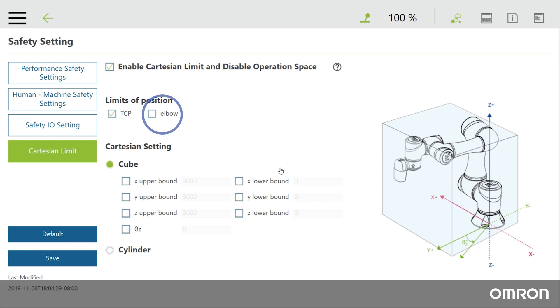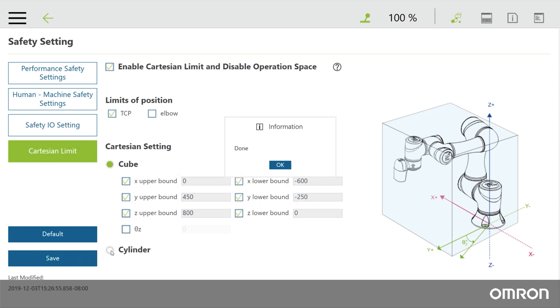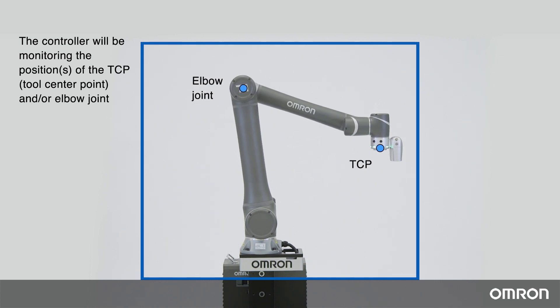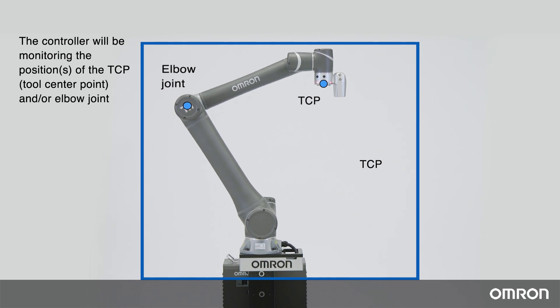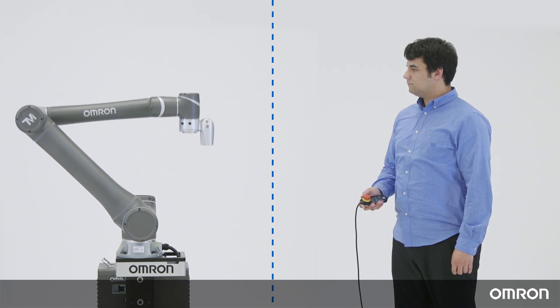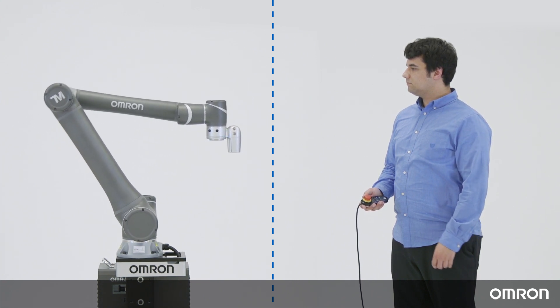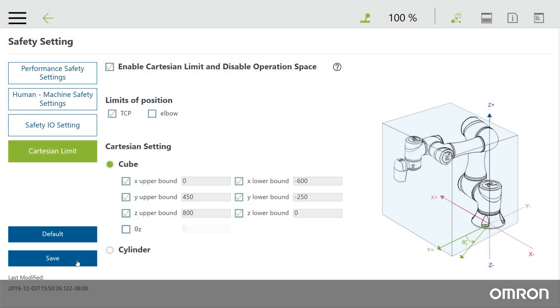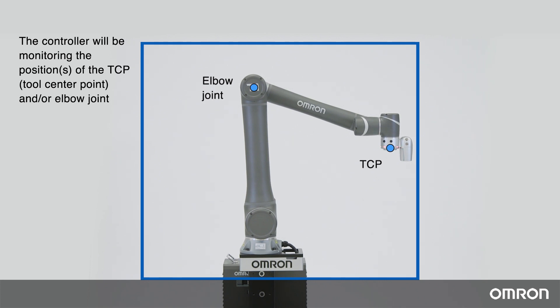Designate which parts of the robot are being limited by the Cartesian space. Users can set the upper and lower bounds on the X, Y, and Z axis to construct a cube around the robot. You can also create a cylinder using upper and lower bounds of the Z axis and the radius of the cylinder. Let's create a cube. See how the robot can't move outside of this cube. Instead of setting up a whole cube, you can designate a plane too. For example, a person may be working next to the robot in an assembly line and we don't want the robot to come into the person's workspace at any time. We can enable just the X axis to create a safety plane. Now the robot will stop when it reaches this plane but is free to move in other directions.